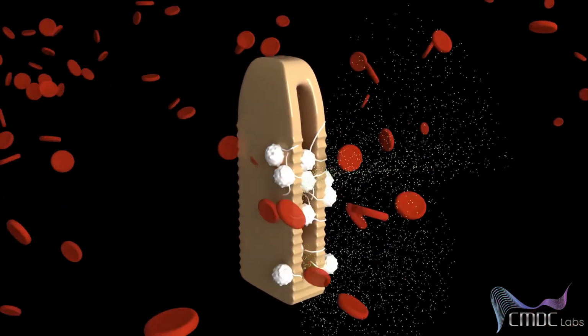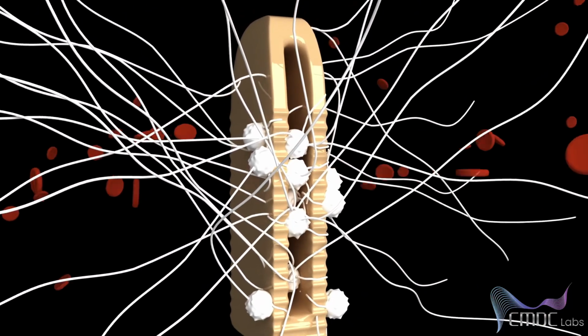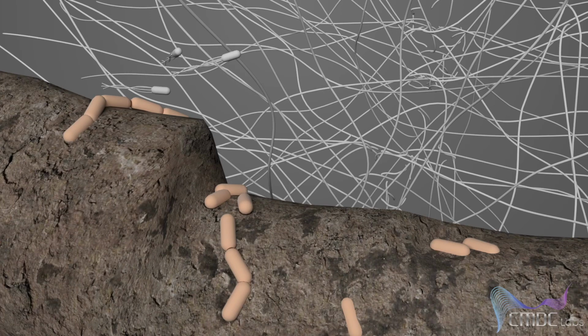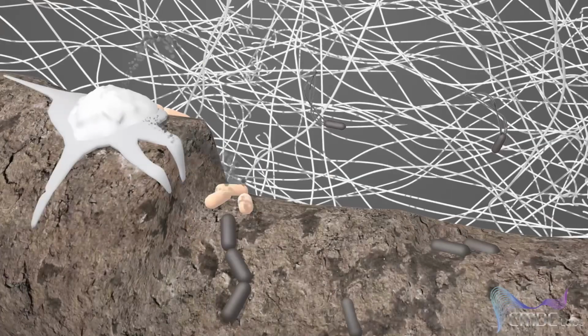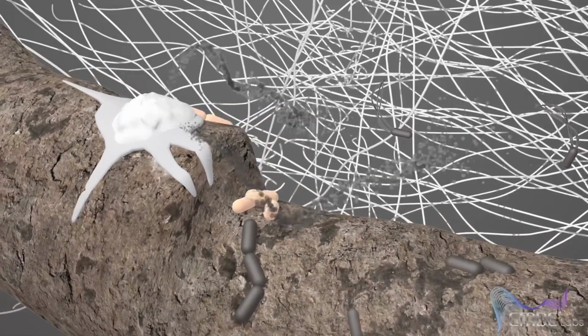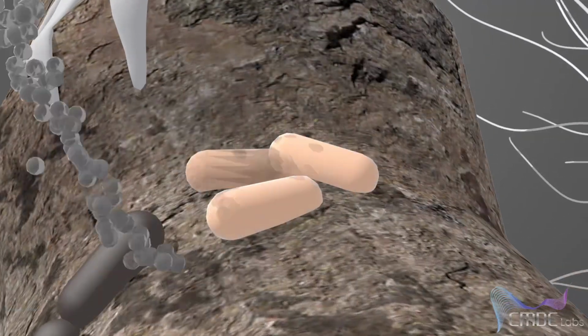During the early stages of the inflammatory response, immunological cells respond by cleaning the implant, tissue debris, and contaminating bacteria. Polymorphonuclear cells, or PMNs, are the first cells to respond following implantation and exposure to a biomaterial. The first step of this process involves utilizing the CT chamber to infuse PMNs along a chemotactic gradient consisting of bacterial proteins, fibrinopeptides, and inflammatory interleukins towards the implant within minutes after injury.